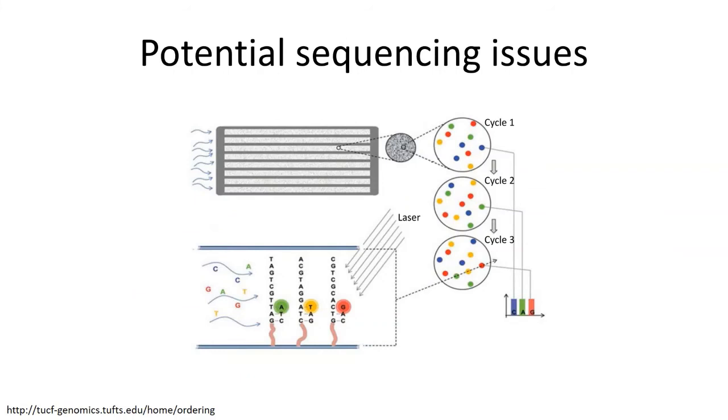Now I'm going to talk about some potential sequencing issues that you might run into from the instrument itself. One thing that is very important for sequencing is cluster density on a flow cell, and this basically comes down to the quantitation of your library. You need to flow in a precise amount of your library in order to get a good cluster density.